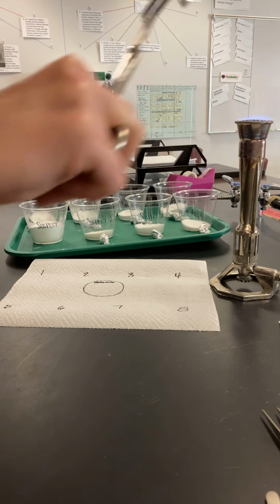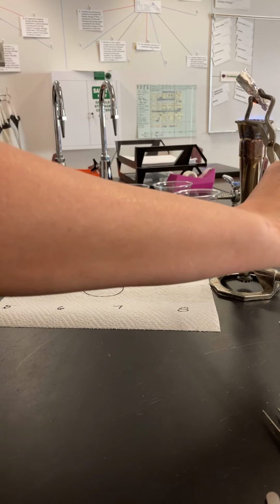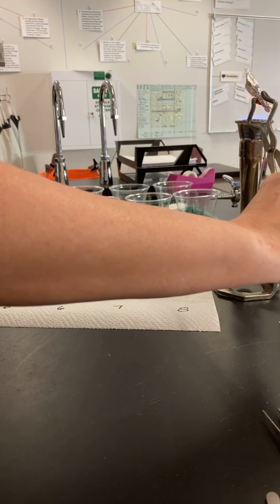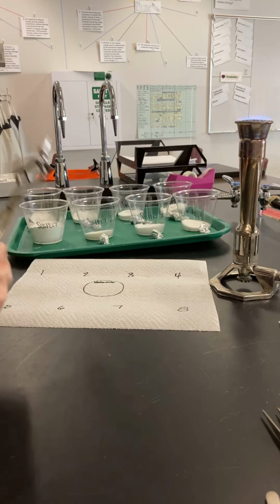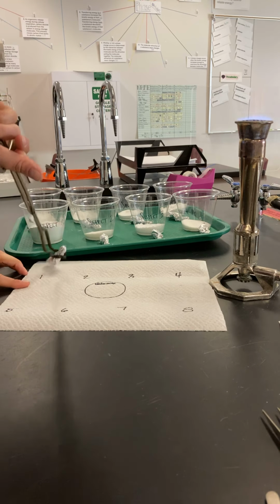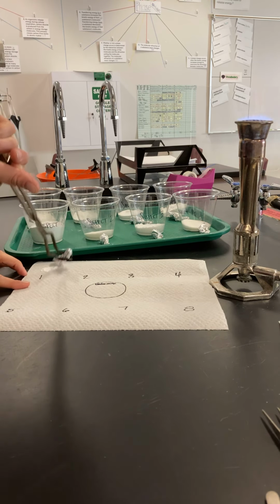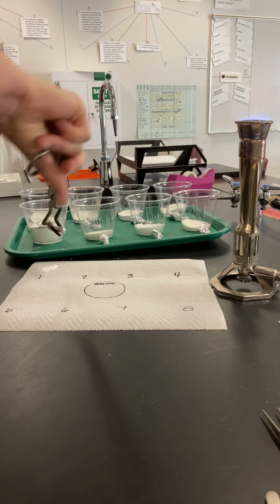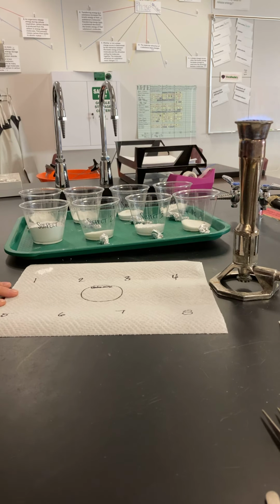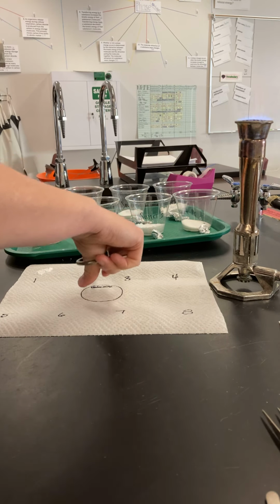All right. So this is suspect 1. 1, 2, 3, 4, 5. Okay. It doesn't really look like there's any change in appearance at all. Again, I'm going to go ahead and dump that substance out, and we'll take a look at that here in a little bit. Okay, so there's really no change. It looks exactly the same as it did before within that 5 seconds. All right, suspect 2.